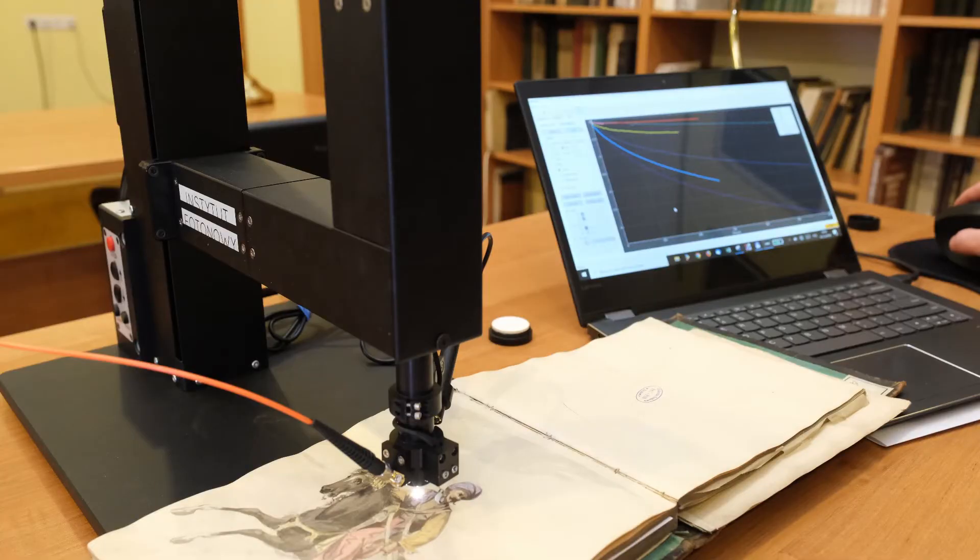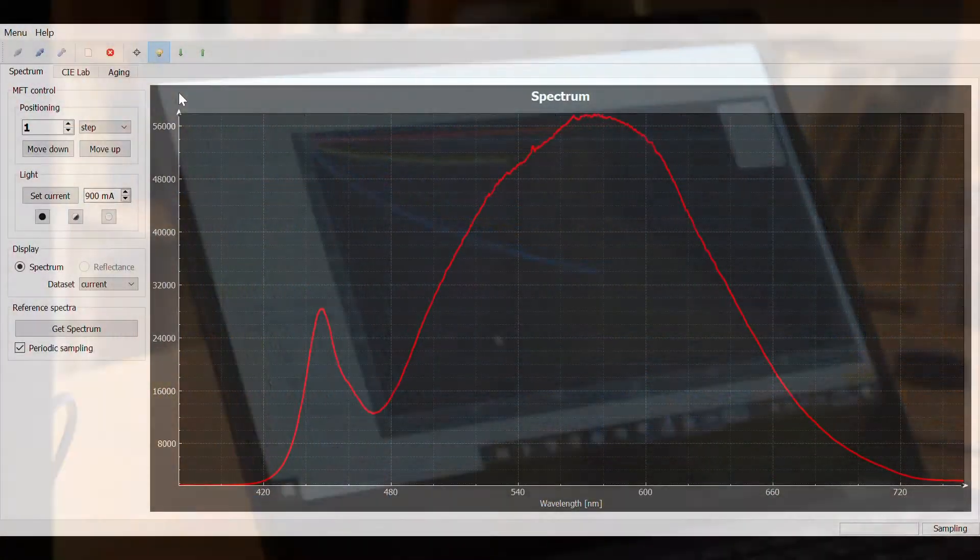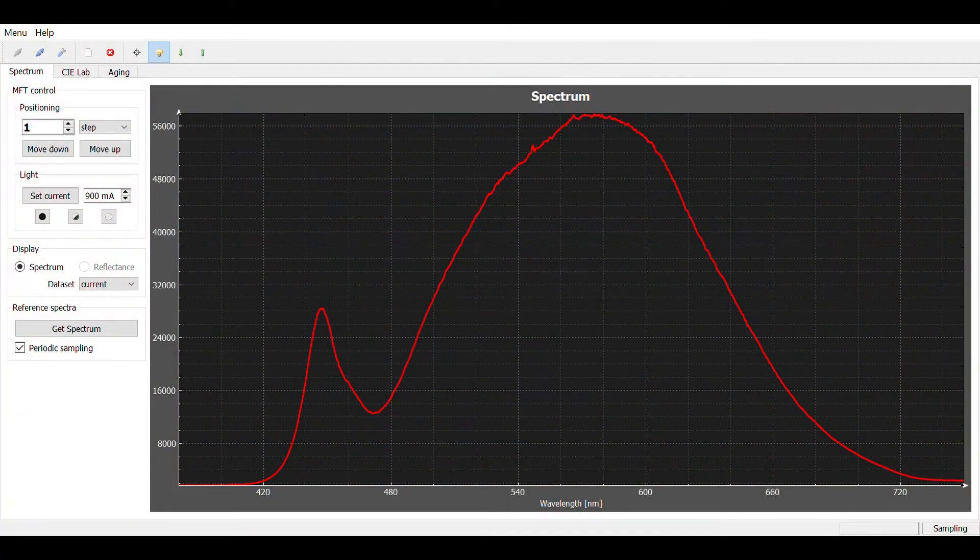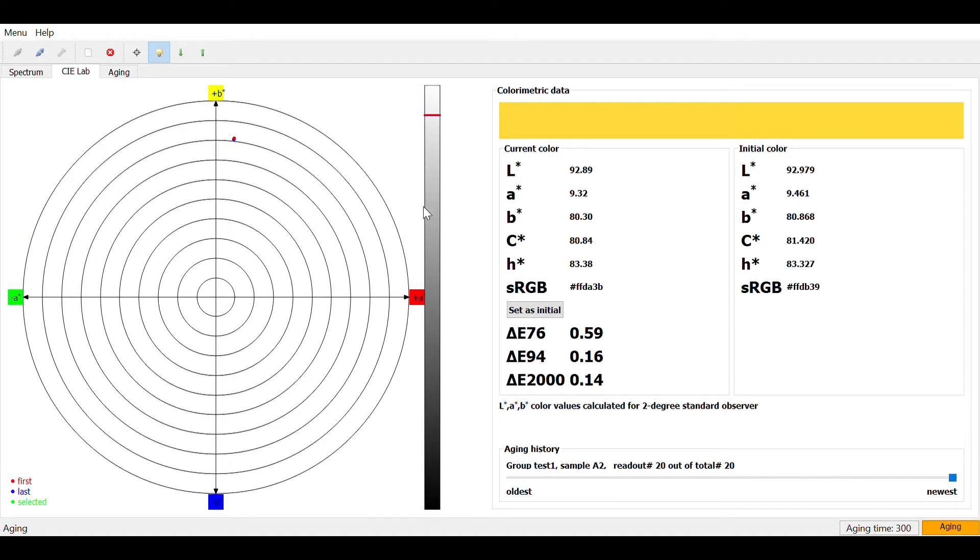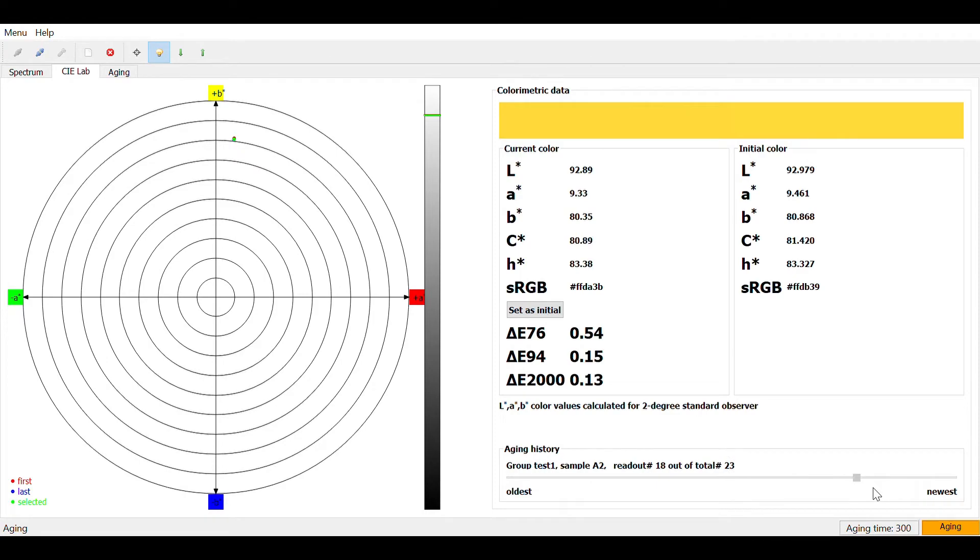The software provides live view onto the actual spectrum, color position in the CIE LAB space, and its time evolution.